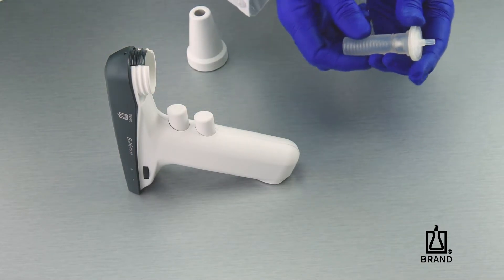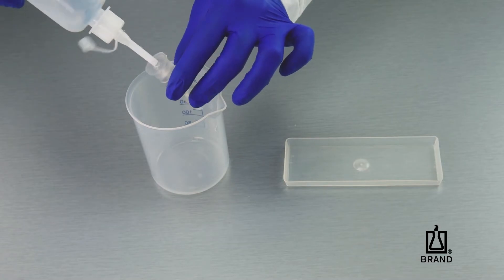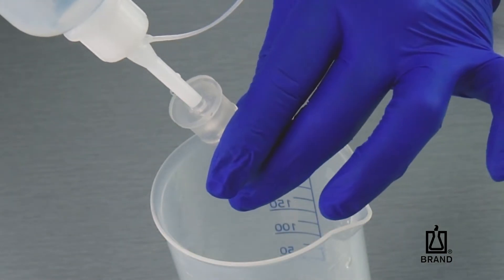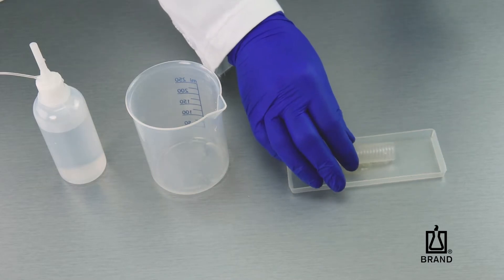With the silicone adapter removed from the housing, pull the old filter out of the adapter. Use a spray or wash bottle with the appropriate cleaning solution to rinse out the adapter, and allow it to dry.